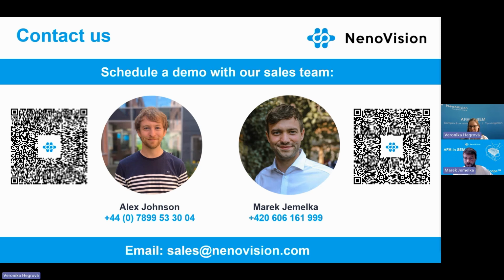Then we have a question coming again from Jaita. Is PFM, so Piezo Force Microscopy, also available on the AFM? Yes, it is available. You can use it. That was an easy one, right? Yes.